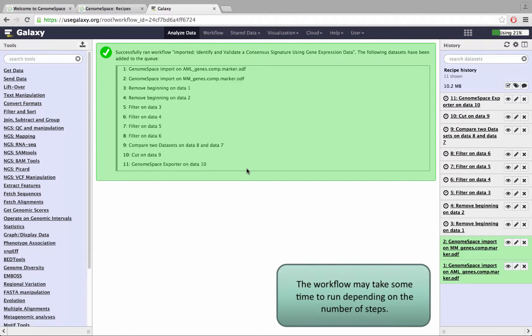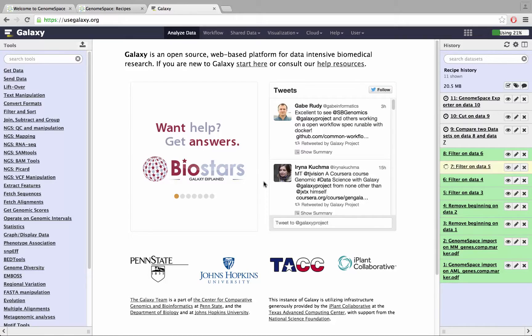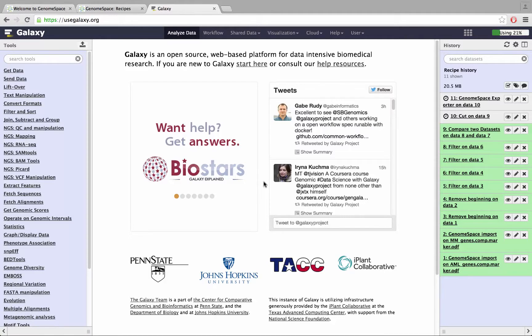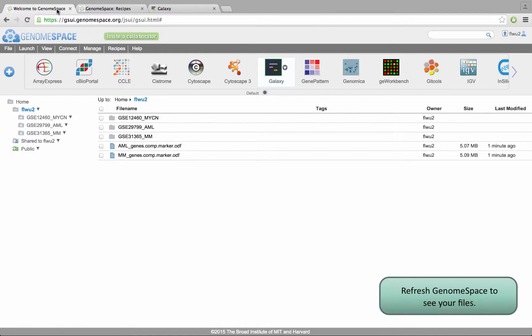Depending on the length of your workflow, it may take some time to run. We have sped up the process here for the sake of demonstration. Once the workflow has finished, return to GenomeSpace and refresh your directory to see your new files.